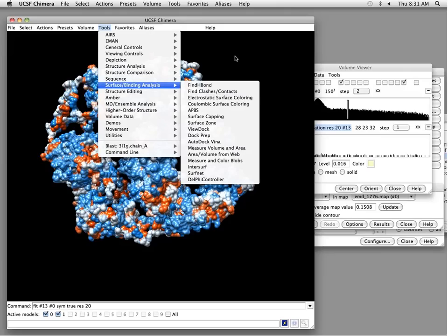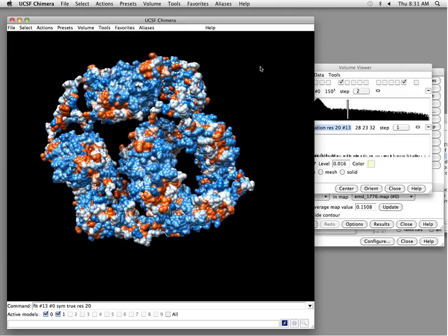Great. I have one question that just came in through the chat, from Jinqui Duan, who is asking how to fit a PDB into an asymmetric volume data. Okay. So if you have a map that doesn't have symmetry, and say two different proteins that need to fit into that map, I can fit the proteins one at a time. Fit the first protein, fit the second protein. But if they don't take into account the clashes between them, then it might decide to fit both of them in the same location. So how would you take into account fitting both of them together?